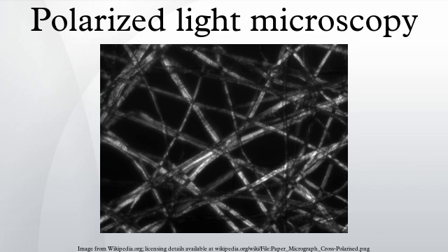Comparison of transillumination techniques used to generate contrast in a sample of tissue paper. See also: Petrographic Microscope.